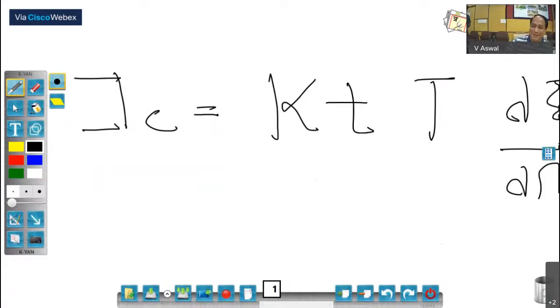So this last term is the property of the sample, which is the differential scattering cross section per unit volume. So now you know everything actually. You know the corrected scattering intensity, then thickness, transmission, and this is what you would like to have, the normalized scattering intensity. And this is the instrument constant, determined from the standard sample, because in the case of a standard sample, you will already know this. So by measuring this, you get this one.